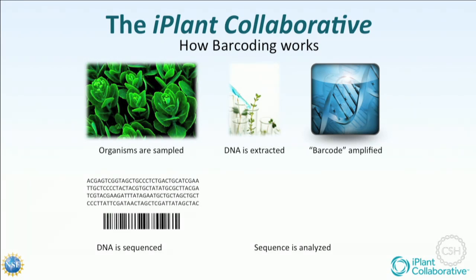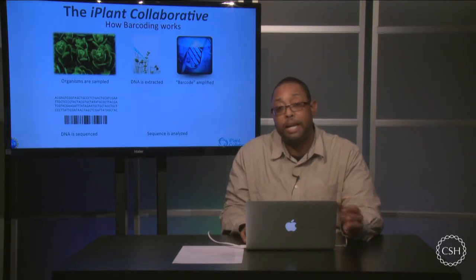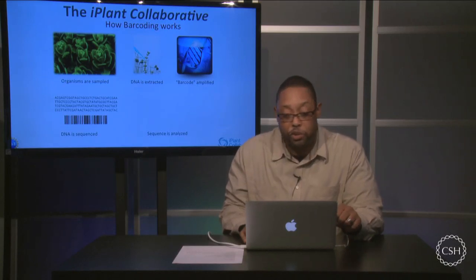Now, after we get the physical barcode or the amplified product, we typically will run this on a gel just to confirm that we have a physical product there. Once that confirmation is seen, we can then move to taking that product and sequencing it through our collaborators at GeneWiz Incorporated. They've offered to give us a discounted level of sequencing in which we will get about $3 per sample, and that will allow us to get the forward and reverse read for about $6.